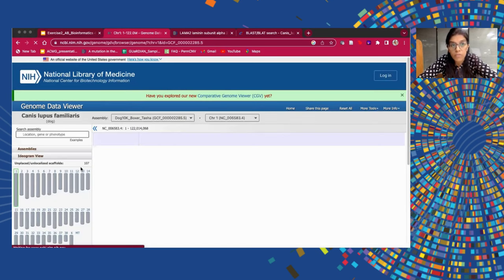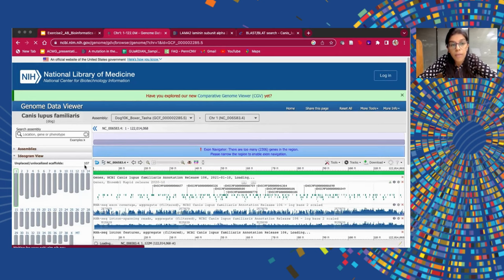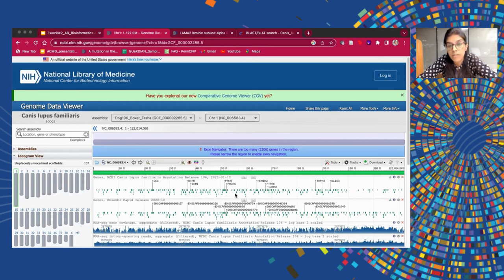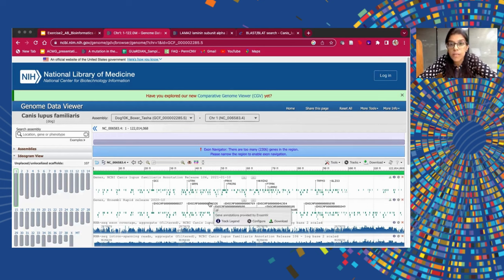Once we press on chromosome 1, it will redirect us to another tab where it will open up the Genome Data Viewer. Here you can see all the chromosomes present in the dog, and towards your right you can see that the capital letter words are the genes present in this particular selected region. You can scroll towards the right or left. On the navigator, known as the exon navigator of the NCBI Genome Data Viewer, it shows there are 2,306 genes in the region. So we either have to zoom in, zoom out, or scroll to find out which genes are present.